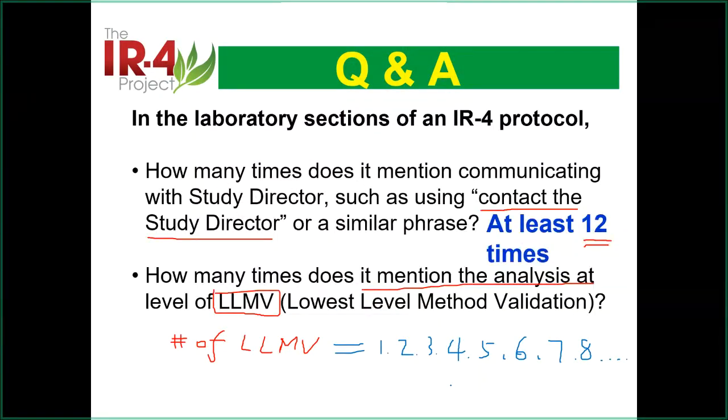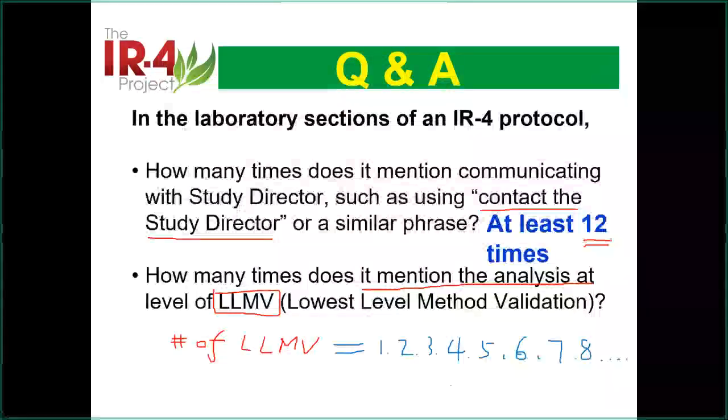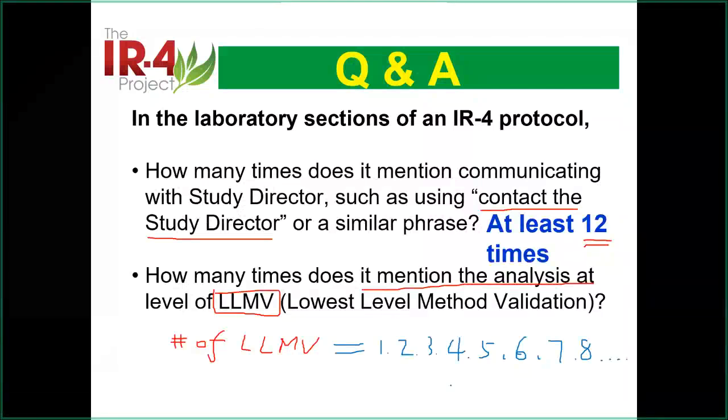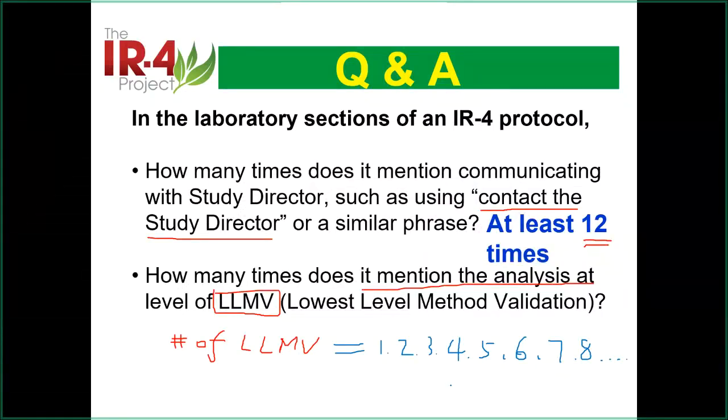So another way is, did something happen? The machine broke in the middle of the analysis. So if it's routine, you do that every 300 injections. You change the septum, and every half a year you do the whole system flush clean. So that's called a routine. That means it's preventive. You just need to do that in case this happens. There's nothing wrong. Your data is good. The instrument is good. Analysis is good. You're running okay. Everything's good.